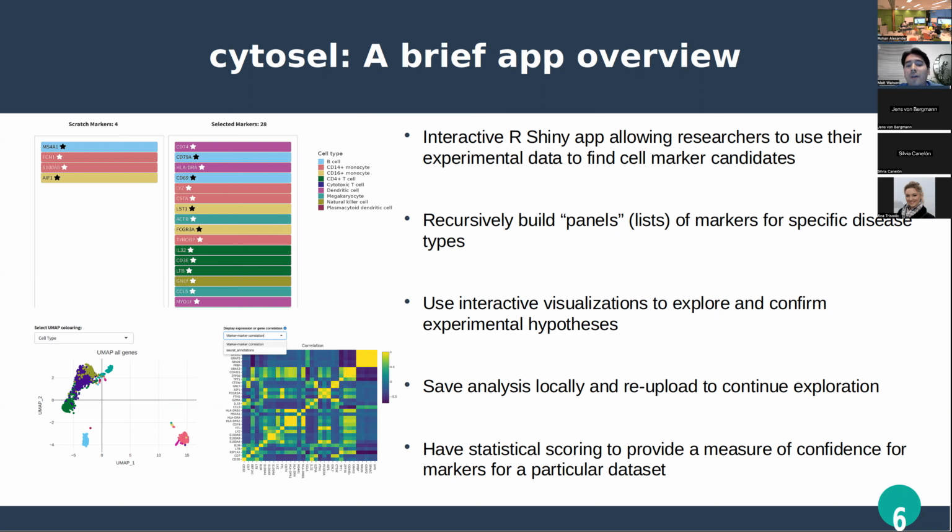We also have statistical scoring for all of these processes, and that provides a measure of confidence for the markers that this application suggests to the user, and gives them an indication of how well their data set is performing for actually identifying these labels, these targets.